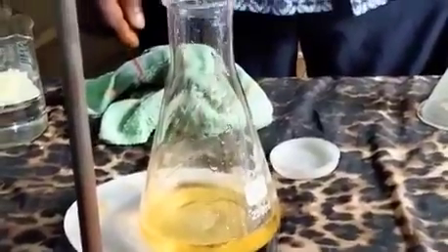We're now watching this place for a color change. So I think we're almost there. It's having some orange color. So I will close the tap, bring out the conical flask and shake it. So you see, we have the glittering orange color. If you compare the colors you obtained today, they're all the same. And the final reading we have on the burette there, after looking at this, is 30.30.